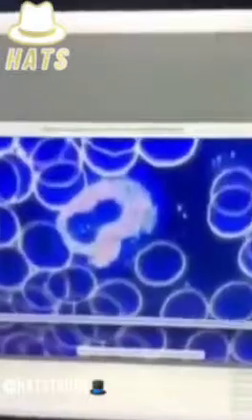So this one is a video. Let's enlarge it. This is actually really difficult to explain because it's a white blood cell, but also very unusual in how it comes out. It's not normal to look at this, and there is overactive movement in this cell.